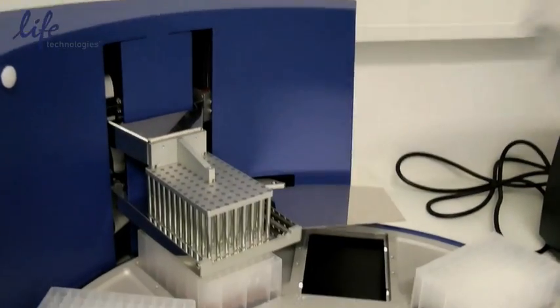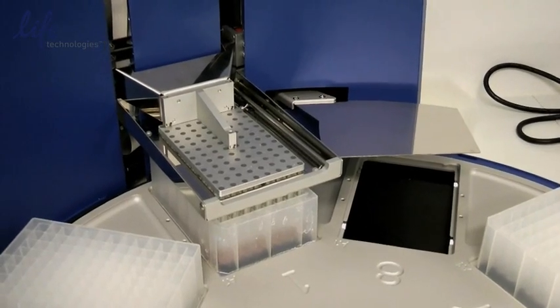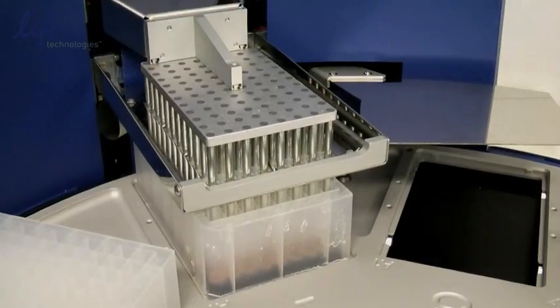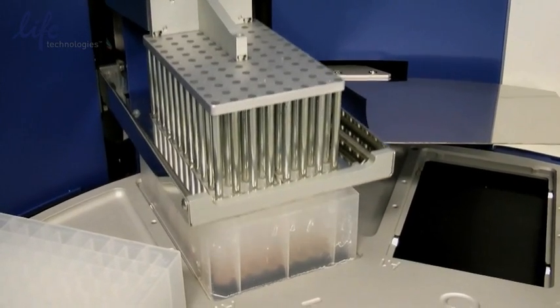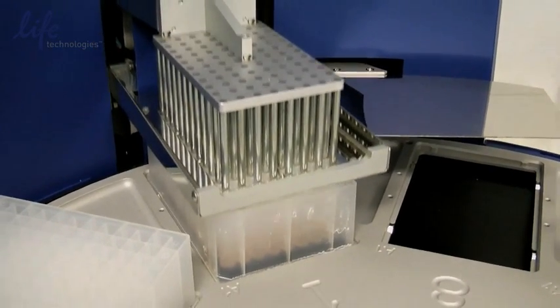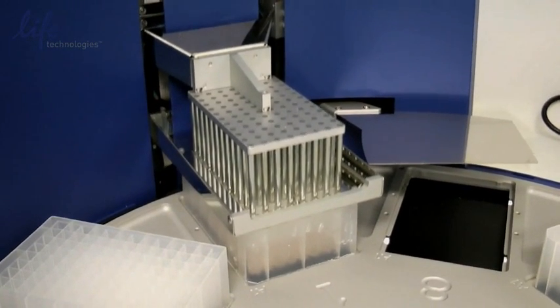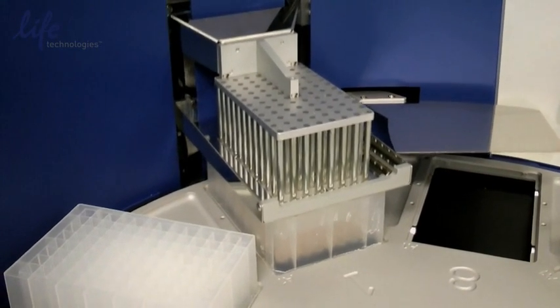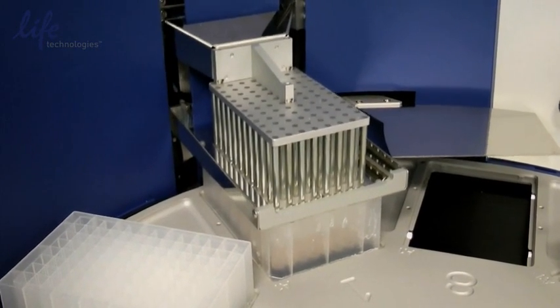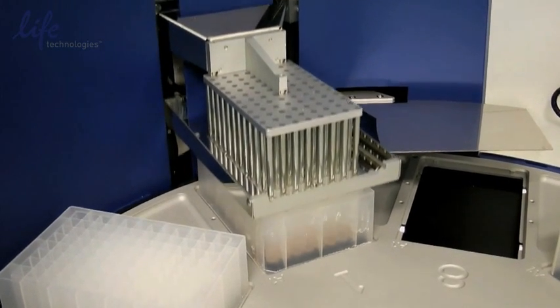The instrument is going to start shaking the sample. The magnets enter inside the tips. Tip combs are moving up and down to mix reagents and lyse samples. At the end of this step, the nucleic acids are bound to the beads and the beads are collected onto the tip comb and transferred to the next plate. The liquid is not transferred between the plates but only the solid beads, removing the chance to create aerosols.